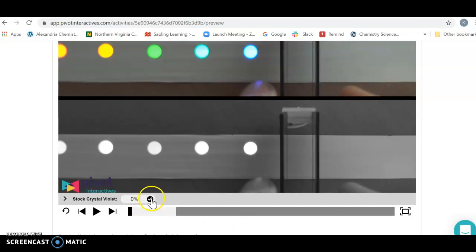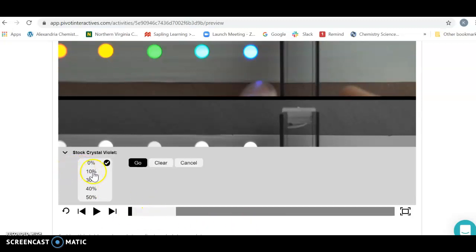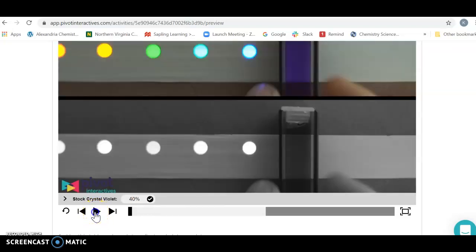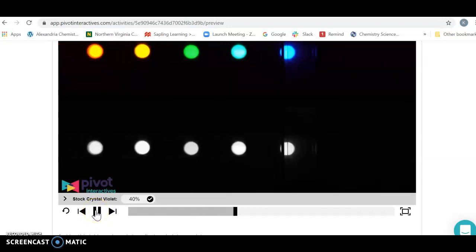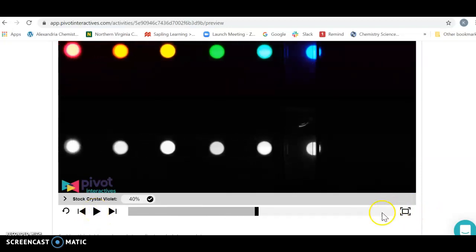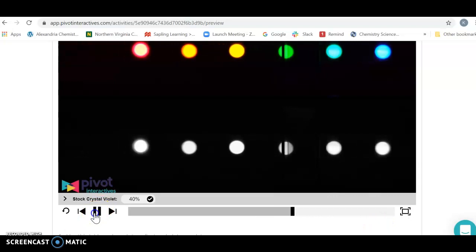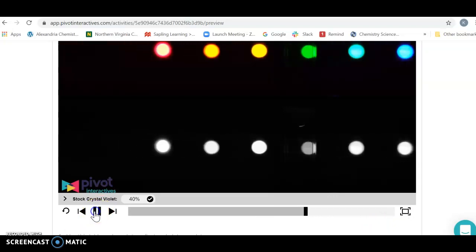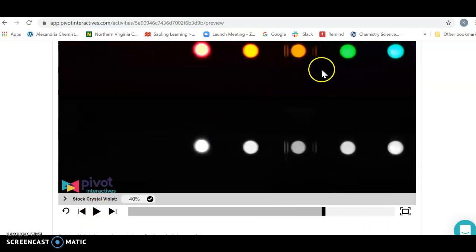What we're going to do is grab a couple of points and make sure it's linear. I find it easier to start with more concentrated, because it's a bit more obvious. Then just hit go, hit play. On your computer it's going to be easier if you make a big full screen, but I can't do that while recording. So I'm just going to continue to hit play here and keep scanning until you get a nice clean color change.